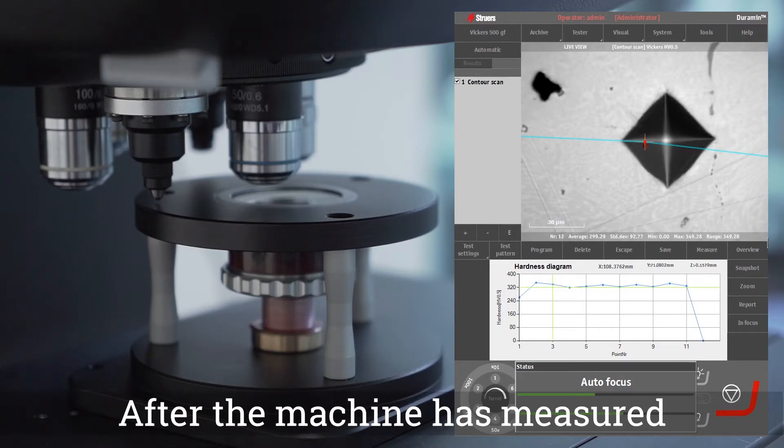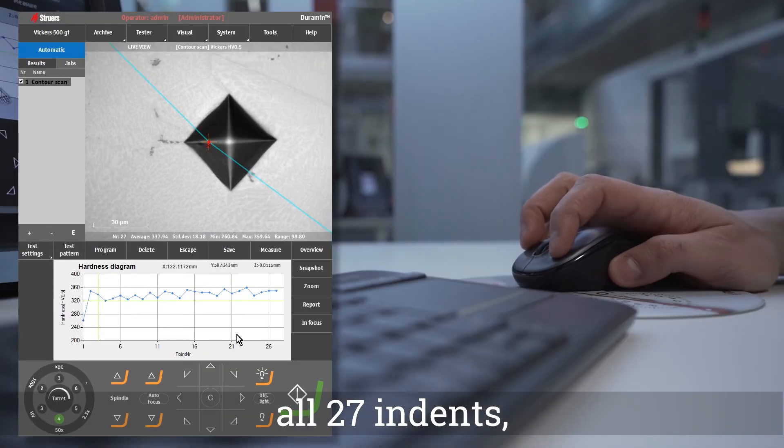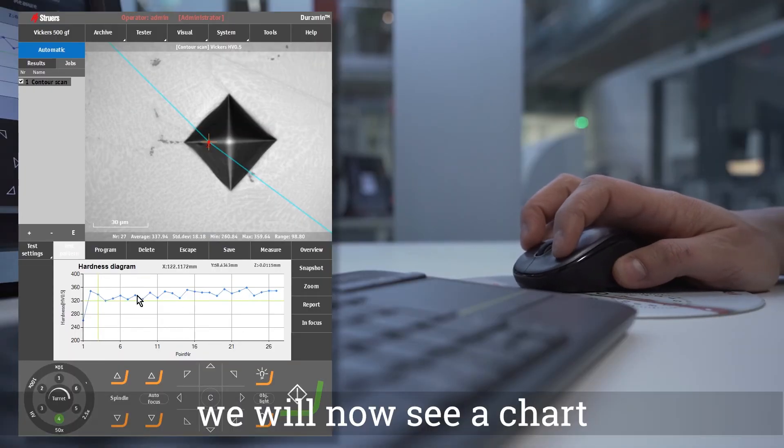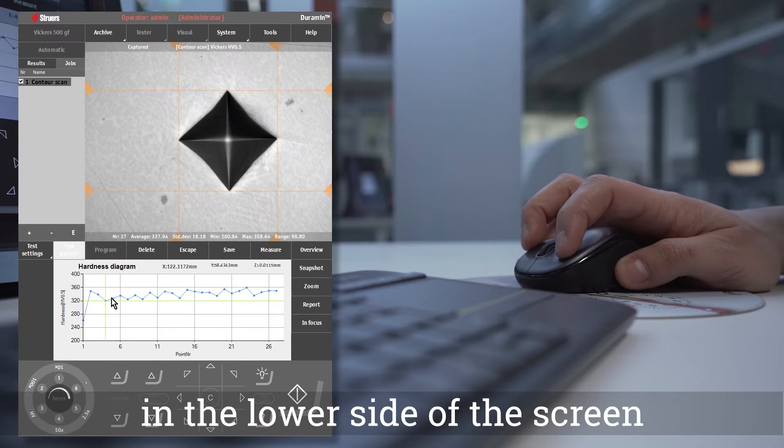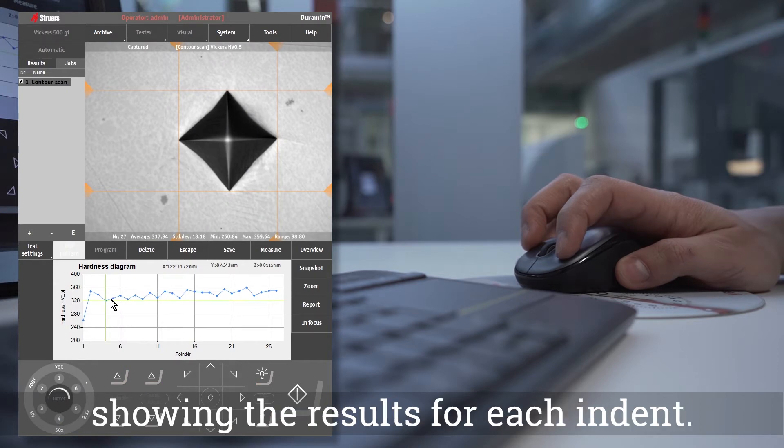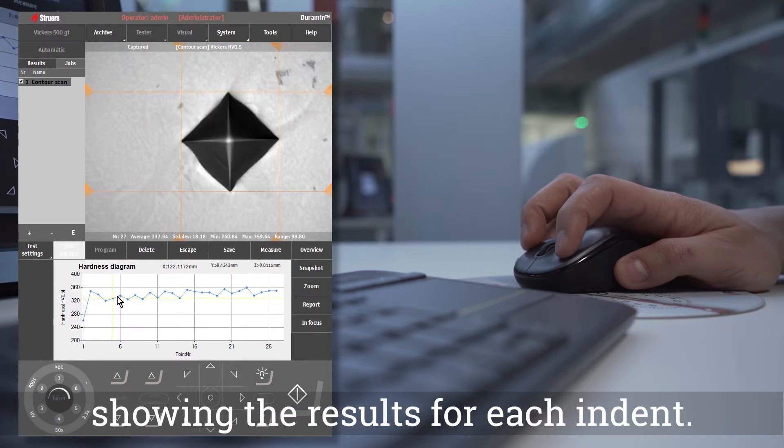After the machine has measured all 27 indents, we will now see a chart in the lower side of the screen, showing the results for each indent.